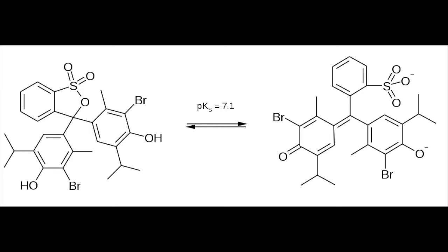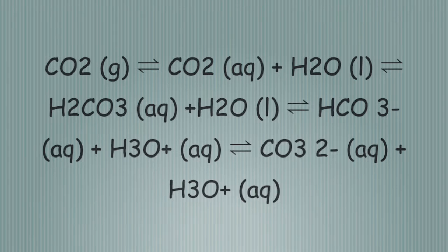So when an acid or base is added to BTB, the BTB reacts with the acid or the base to indicate which one, the H plus or OH minus ions, are more prevalent by color changes. Yellow for more acidic environment and blue for more basic environment.